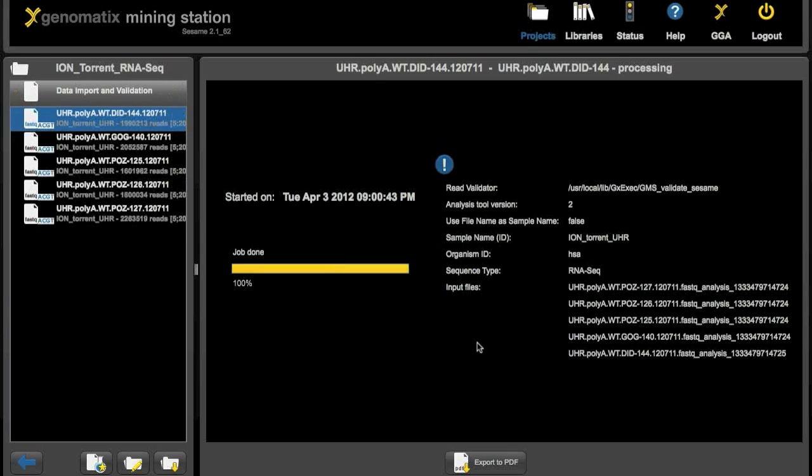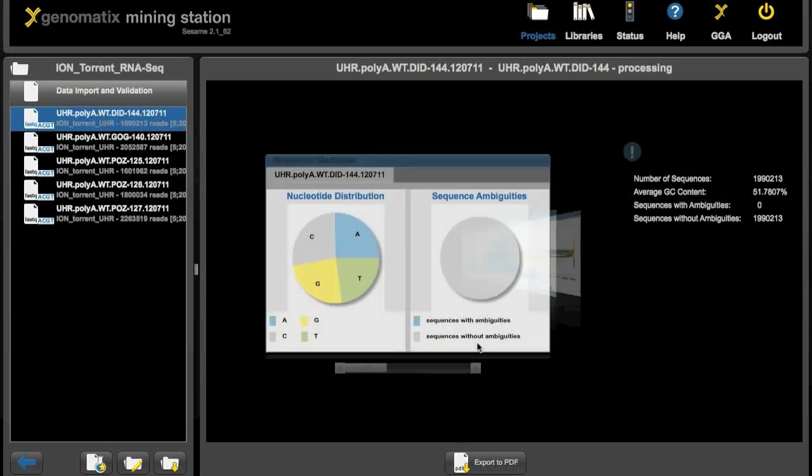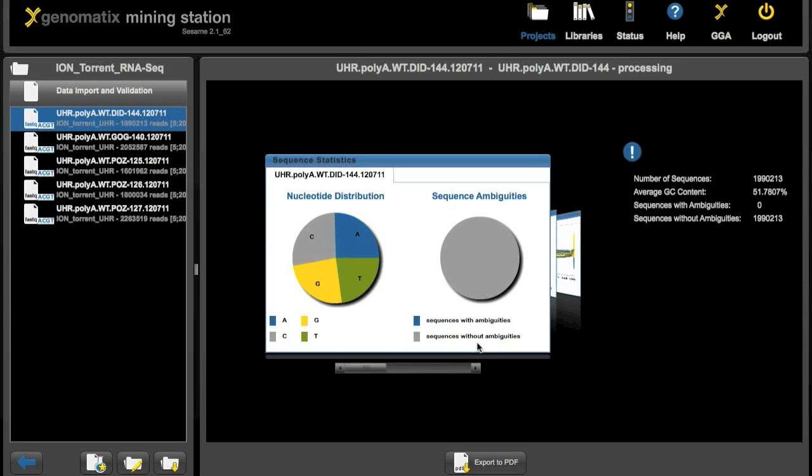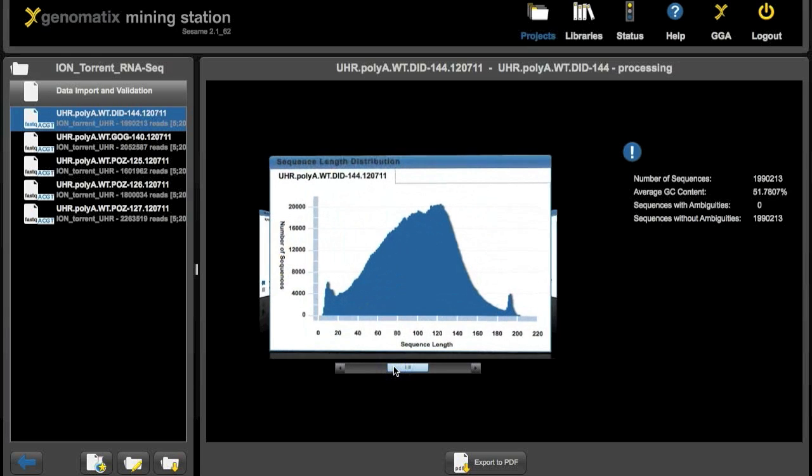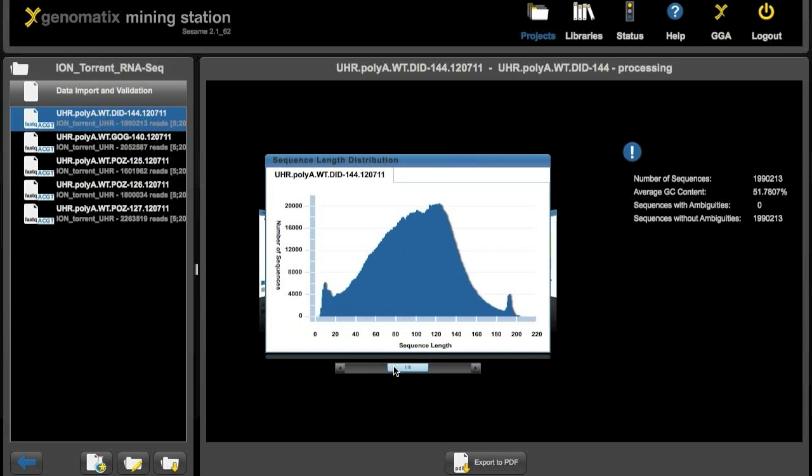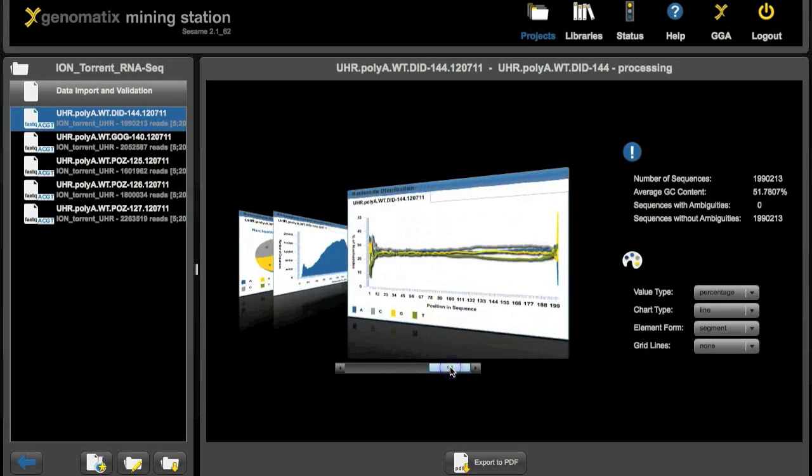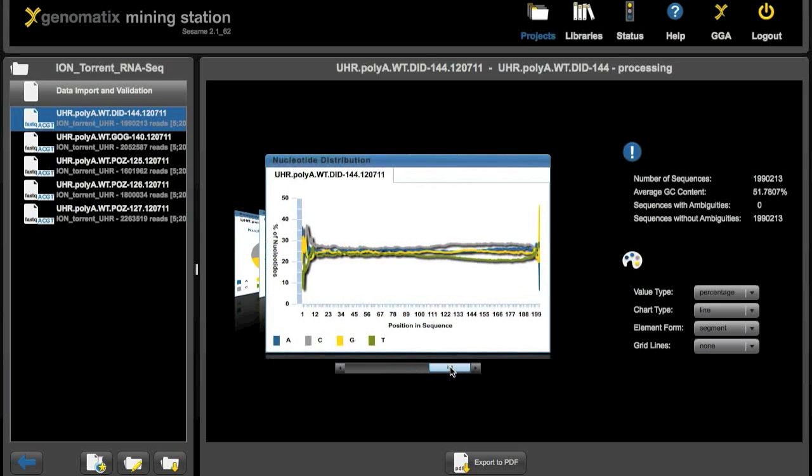And when the import is done we get some key statistics for the reads that we just imported. Here is the nucleotide distribution overall and the ambiguities. Here is the length distribution of the reads, from about 5 to about 200 nucleotides in this case. And this is the nucleotide distribution along the length of the reads.